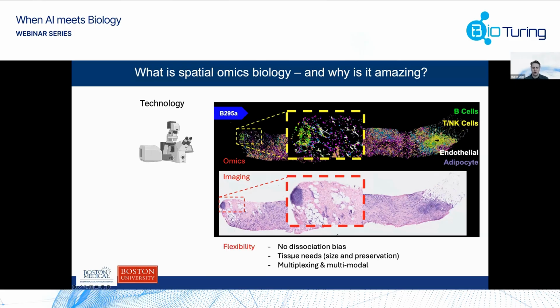There's also the requirement of tissue needs. With spatial, you can do it even on the smallest tissue you can think of. We even did it on a very tiny metastatic biopsy that is a needle thick. You can also do it on any type of tissue. You can do it on FFPE, which makes it immediately amenable to the clinical situation, where you can potentially think about how we can use this in the clinic. And then there are many ways that you can multiplex and do multimodal, and I will show some of these examples during my talk.